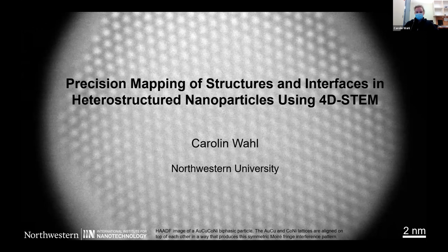Thank you. Okay, yeah. Like Paul was saying, I'll talk a little about how we can really take the 4D STEM platform, and I'm going to push it down to the resolution limits and look at what we can do on the single nanoparticle level. So in the Mirkin group specifically, we really specialize in the synthesis of complex nanoparticle structures. And we want to know, well, what's going on in these more complicated systems.